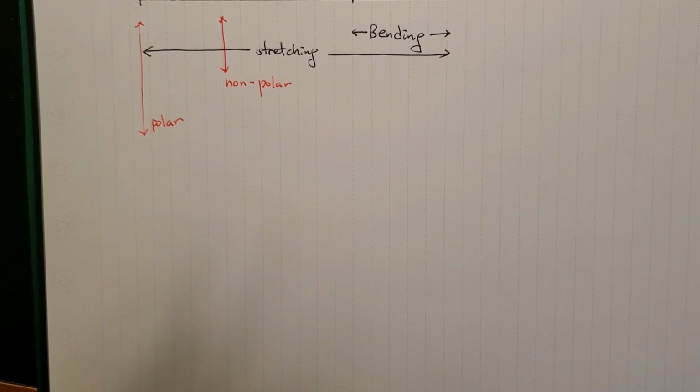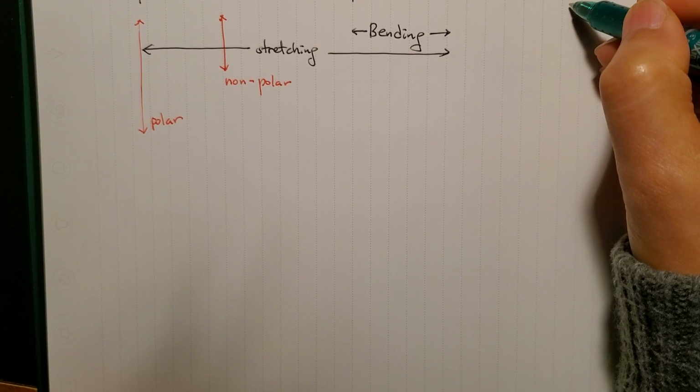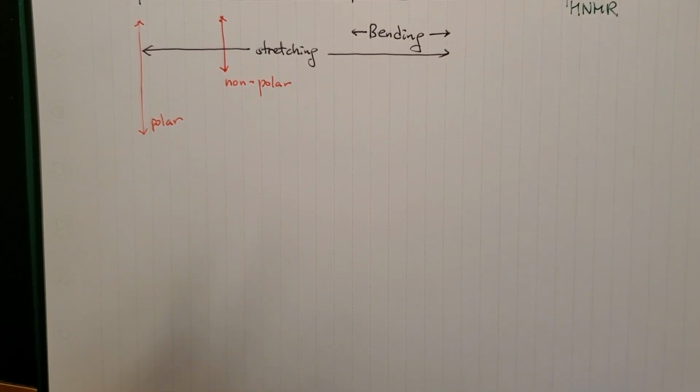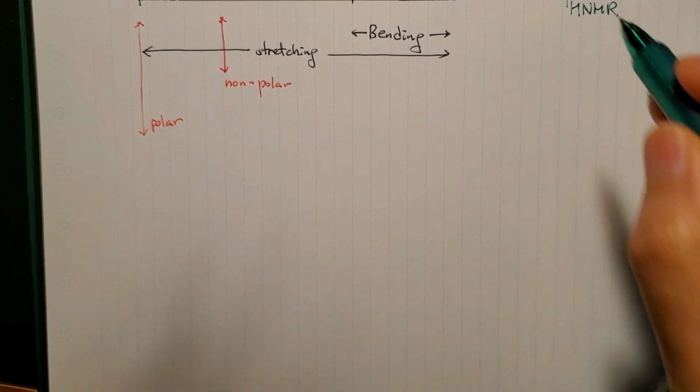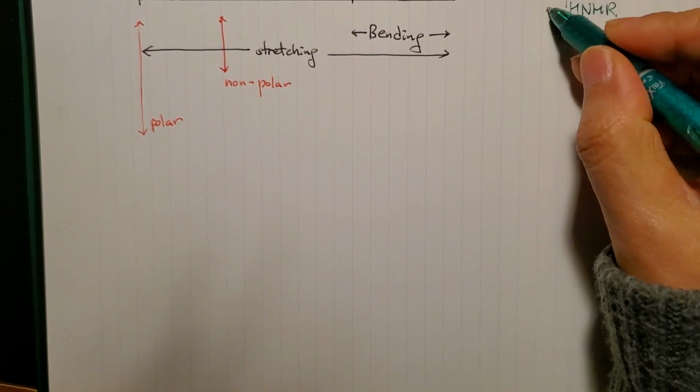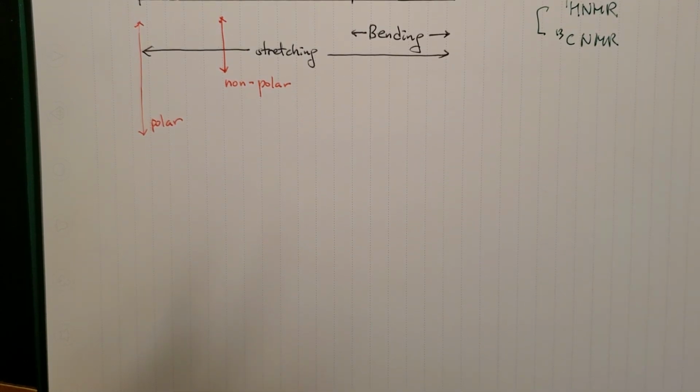But the one with the carbon hydrogen is troublesome. But you should know you have an NMR, HNMR, to read those signals in detail. And the carbon 13 NMR also will give you more specific information about carbon related functional groups, or alkane, alkene, alkyne.